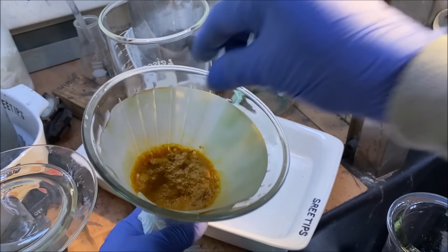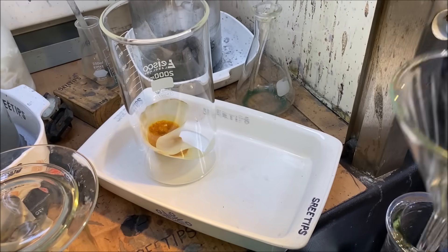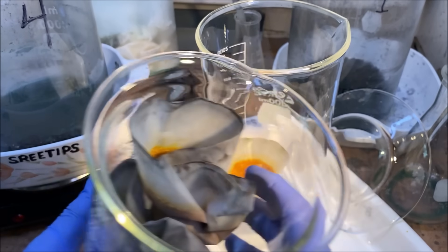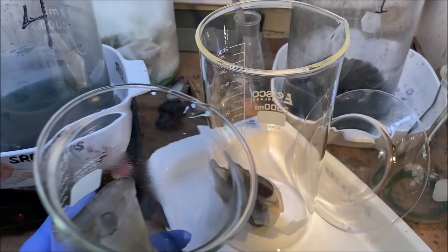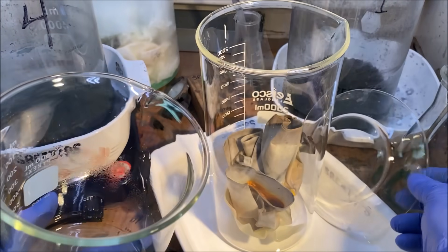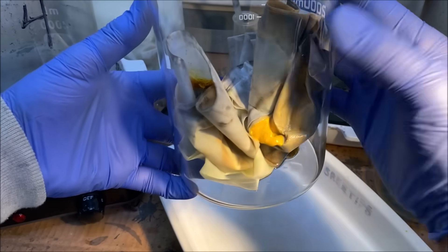What we're going to do is take this now and add it to this beaker. Here are the other palladium filters — we're going to add these to this large beaker now. These are full of palladium salts.